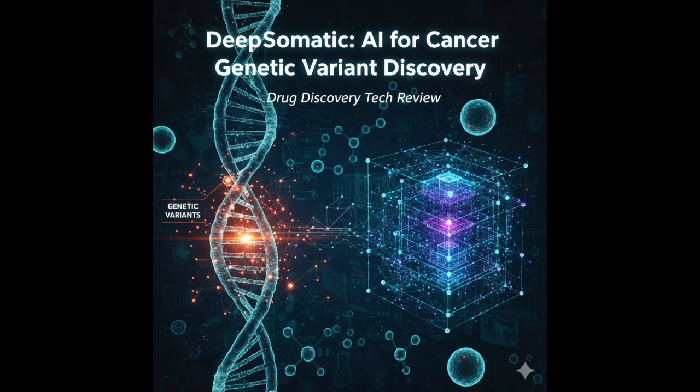Fascinating. So how do you get from raw DNA reads, those BAM or CRAM files, to an image the CNN can understand? Let's walk through the pipeline, starting with that first step, make example somatic. Right. This is the crucial data preparation and transformation stage. The script make example somatic takes three main inputs. You need the aligned reads from the tumor sample. The BAM or CRAM file.